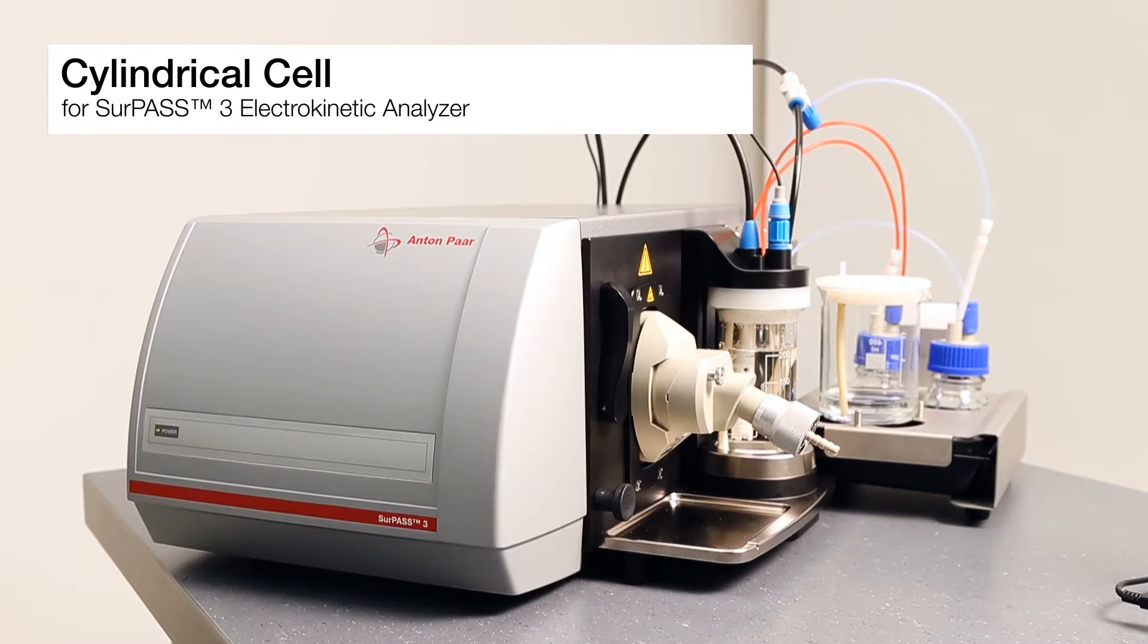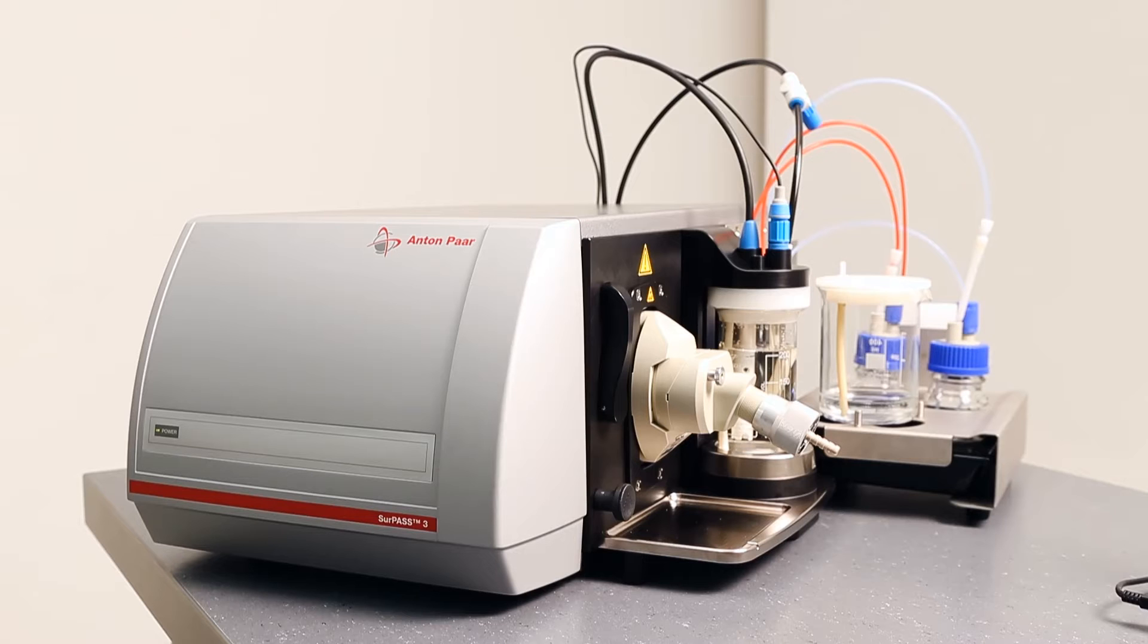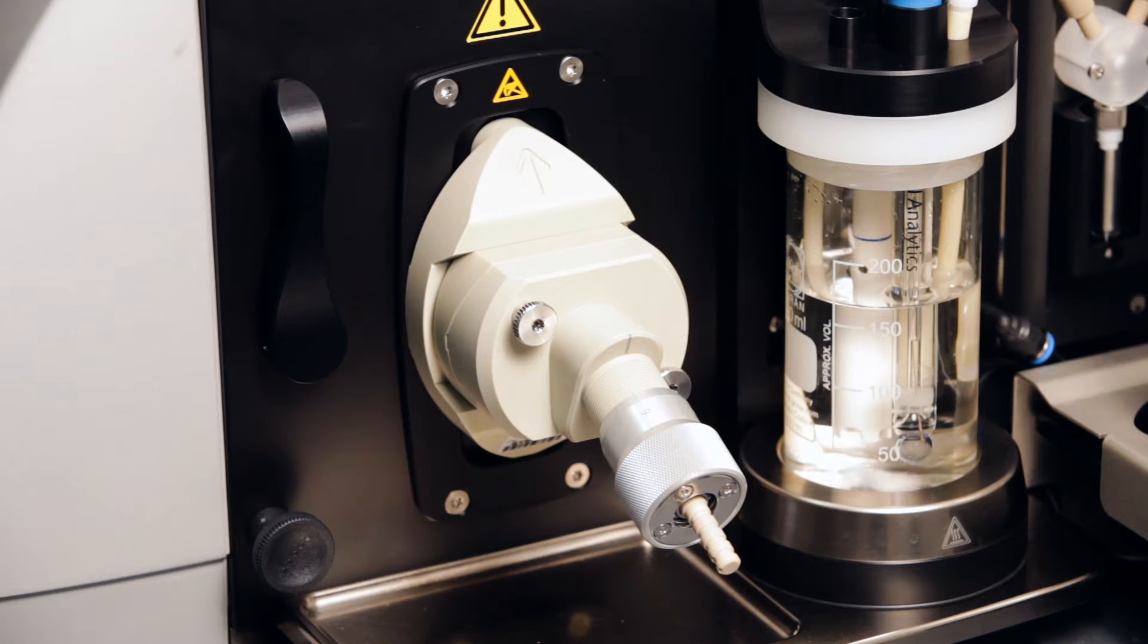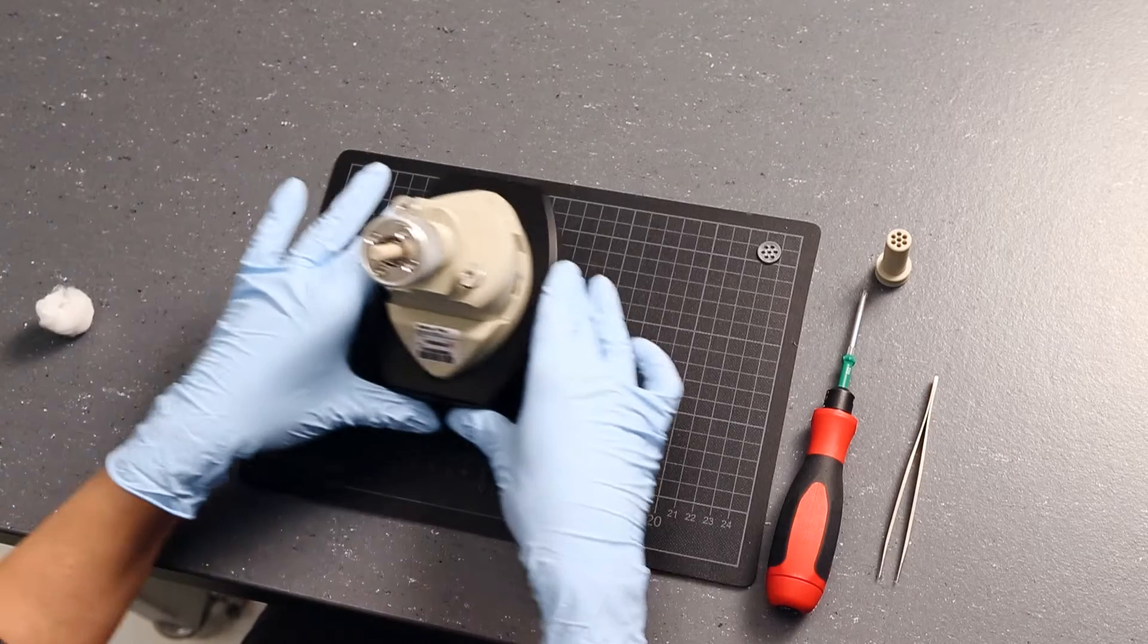This is the cylindrical cell for the SURPASS III electrokinetic analyzer. It's a measuring cell for fibers and granular samples. This video shows you how to mount a fibrous sample and a granular sample in the cylindrical cell and how to mount the cell in SURPASS III.